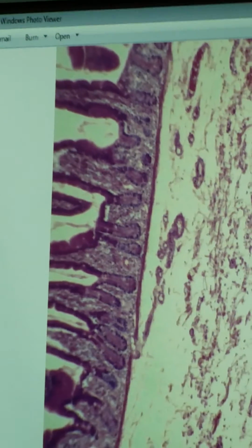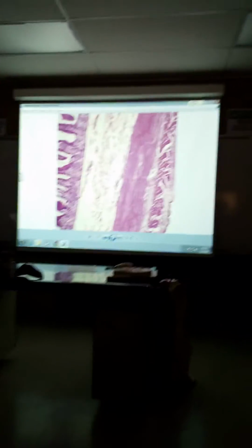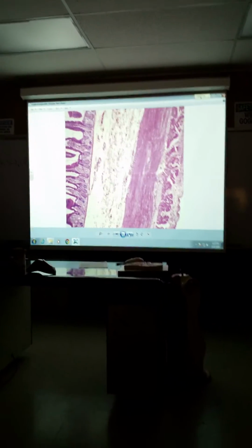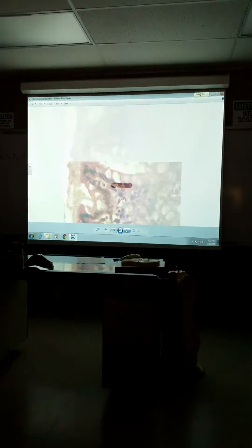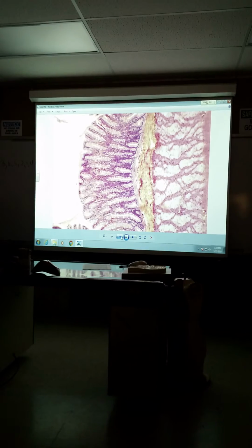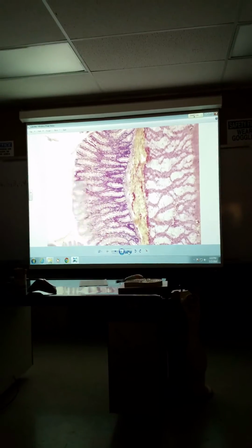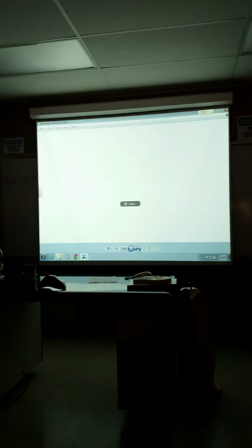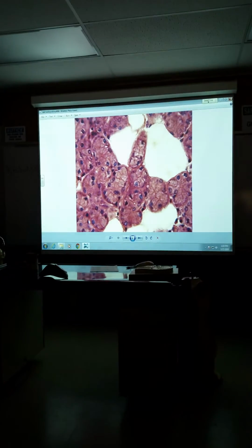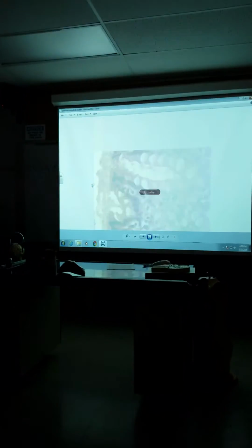It doesn't look like anything, so I'm not gonna mess with it. This is a nice picture, though. Did I already talk to this picture or no? Yeah. Good. That's a good picture. Oh, let me see if I can find Taenia coli for you, and then I'll be done. Can't see enough of the longitudinal muscle to see. That's it for that. And I think, folks, not gonna find T. coli either. Nope.